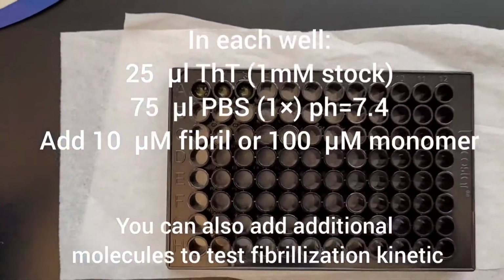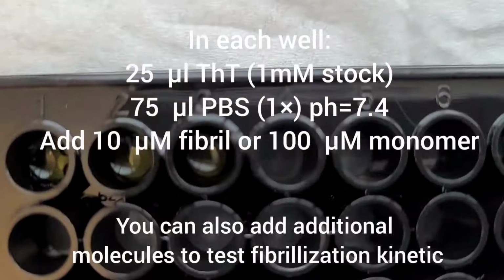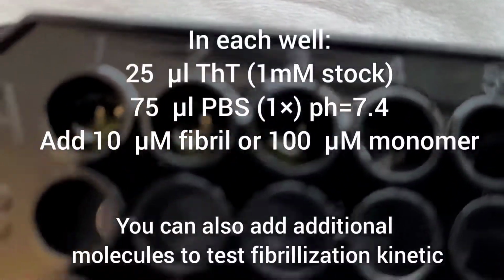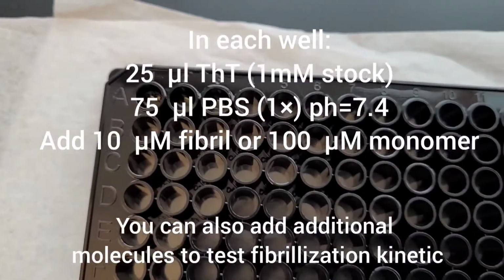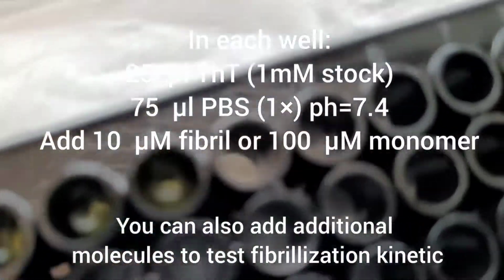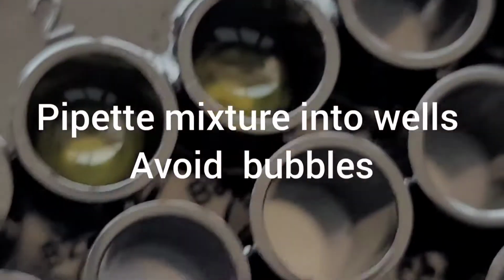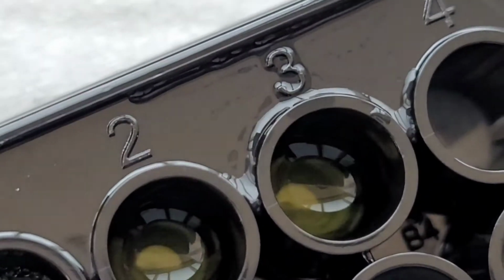To do the experiment, you need 25 microliter of ThT from a 1 millimolar stock that you have to prepare, and 75 microliter of PBS, pH 7.4, and 10 micromolar fibrils or 100 micromolar of the free monomer.